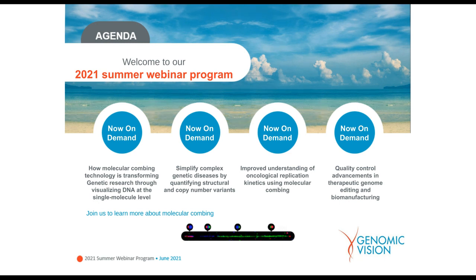Okay, thanks, Imen. We're showing one more question here on the list, and that is how frequent these sister chromatid fusion events are. Okay. From our experience, with the range that we found, it varies between 0.2 to 4%.